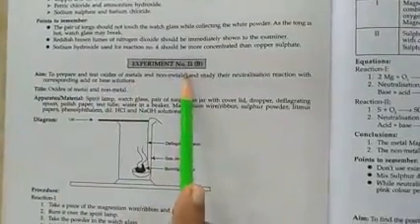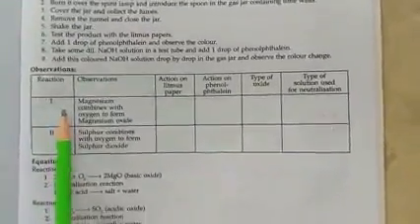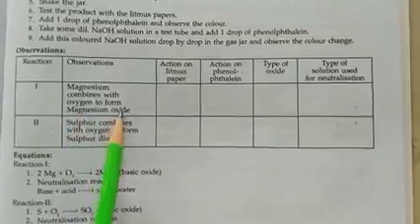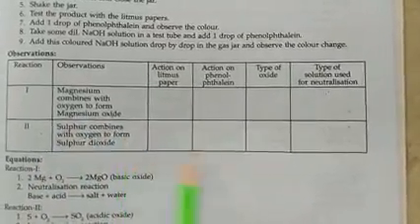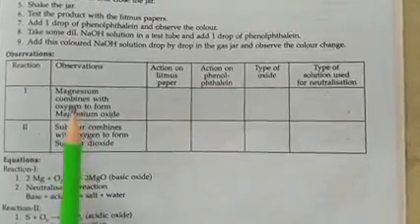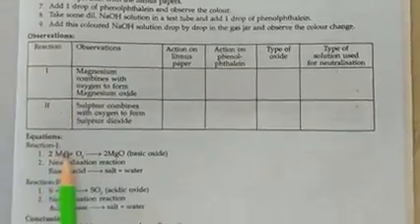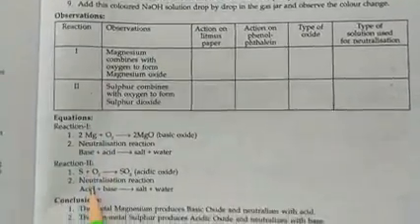This experiment is divided into two reactions. Reaction one and reaction two. Reaction one is magnesium combining with oxygen to form magnesium oxide. If you get this experiment on the day of examination, you have to complete both reactions and write the chemical equation as well as the neutralization reaction for both.